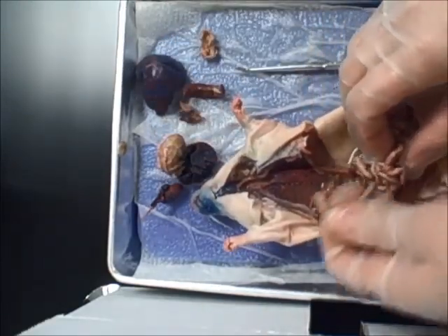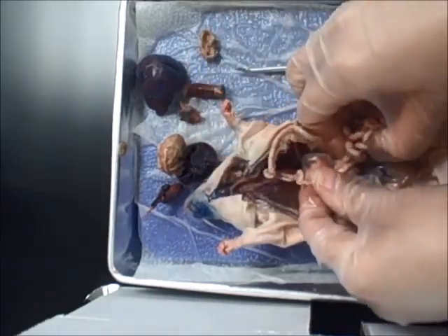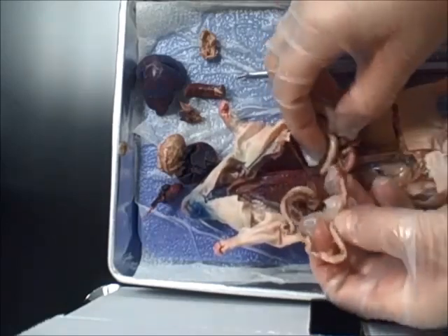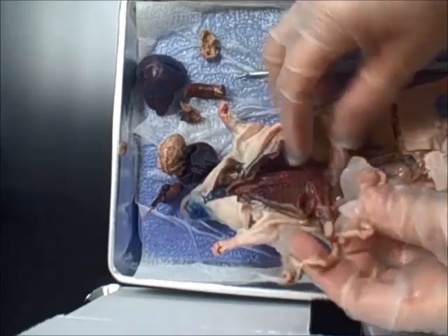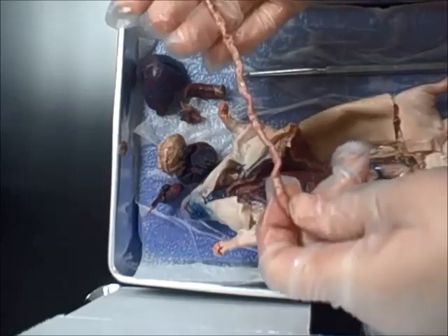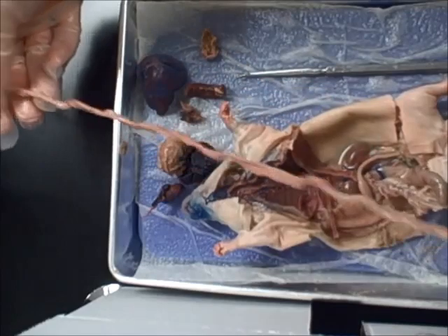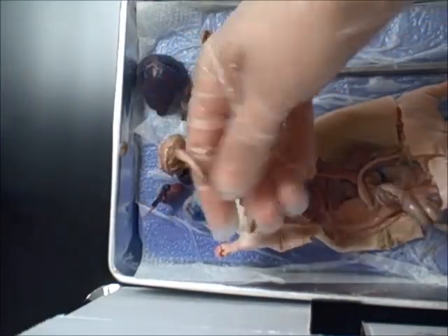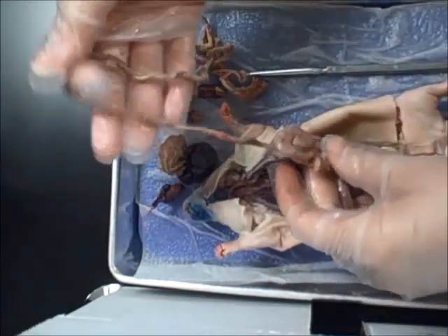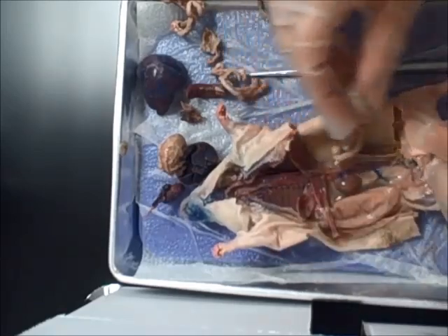Leading from the stomach, you have the small intestine. The small intestine is small in diameter but long in length. So if you remove the mesentery that are holding this small intestine all coiled up, the small intestine should probably be just shy of 1 meter long. So all this is small intestine until you get to the cecum. Cecum, right after the cecum, is the large intestine.